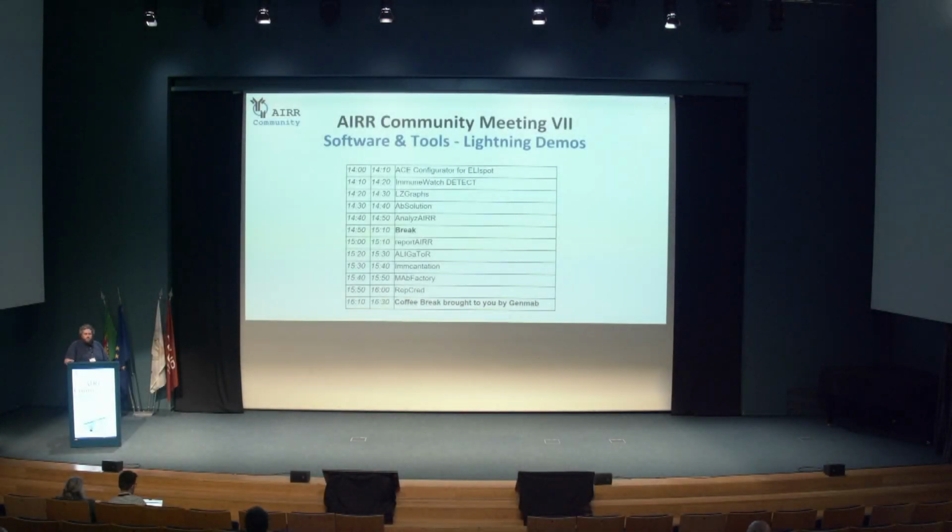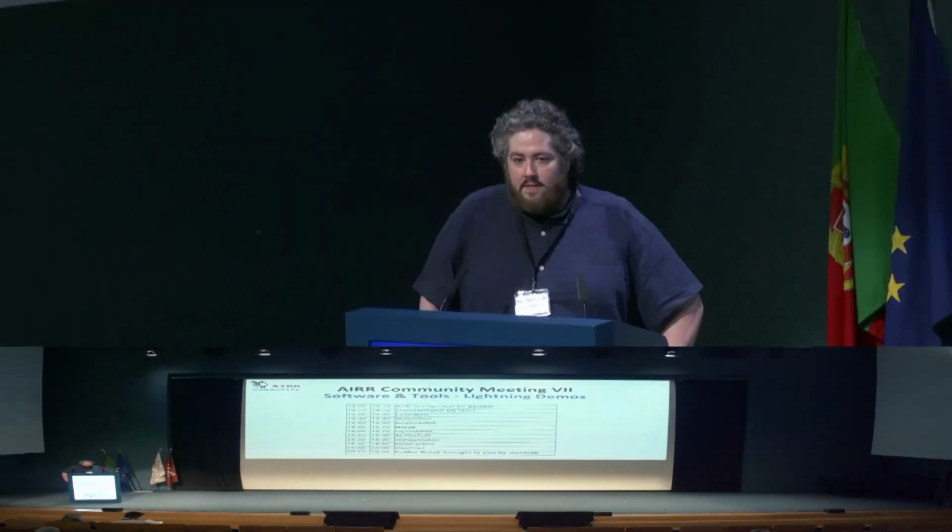Help us to sequence and analyze sequence data from repertoires, as well as many different additions, developments, and new features to some of our favorite packages, libraries, and otherwise. In the sessions that follow here, this and the next session this afternoon, we'll get to see a highlight reel of those tools and the changes which had been made in the last year.